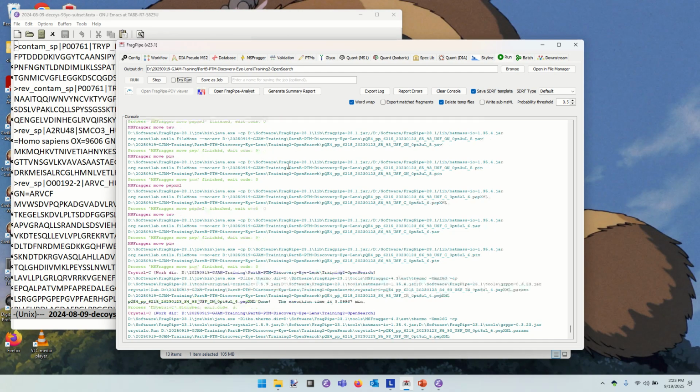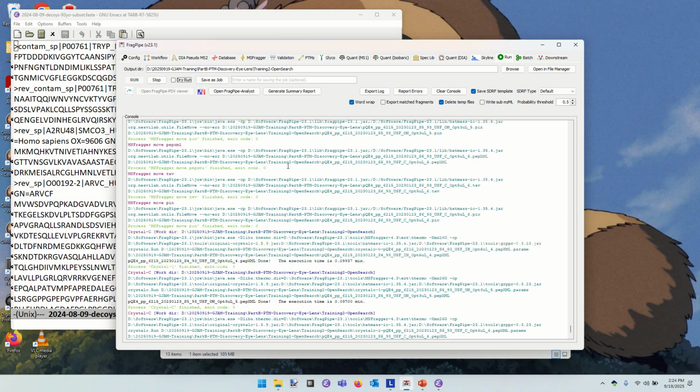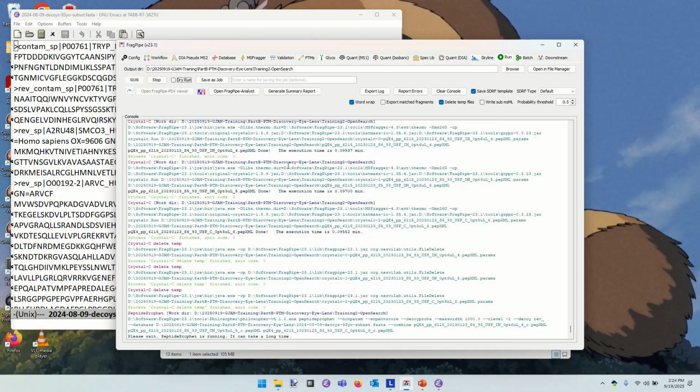When we start adding on post-translational modifications, our search space can really bloom into something entirely other. If you include just serine, threonine, and tyrosine modifications, that's already more than doubled the number of peptides that get compared to every spectrum. The reason is we have an exponential growth in how many different ways a given peptide gets compared to spectra when we add PTMs into play.